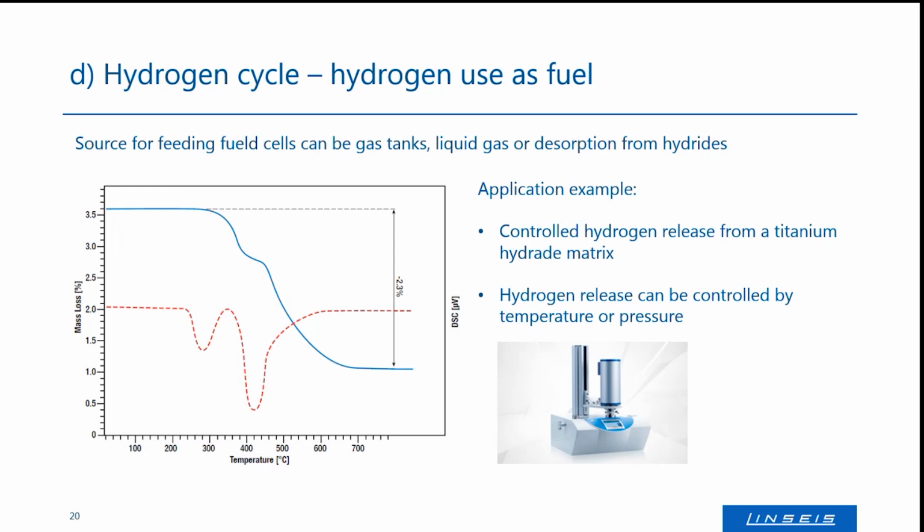Then the sample was put into the thermal analyzer. Then it was heated. It was just heated at ambient pressure. And during heating, the hydrogen molecules that were adsorbed were then desorbed. You can see the mass change in the two-step desorption process, and you also can see the heat flow. You can see the heat consumption during the release.